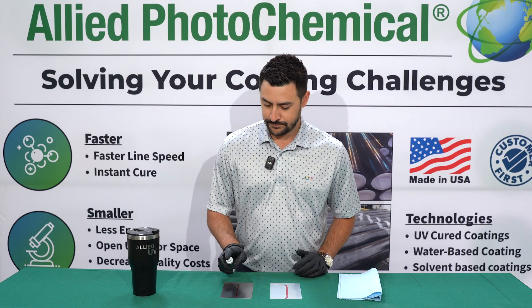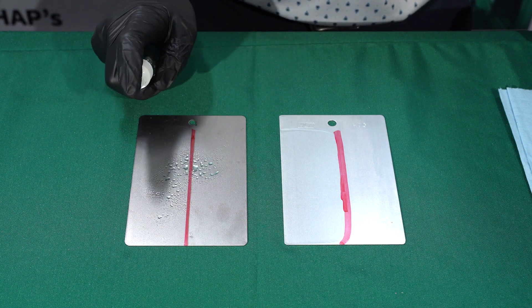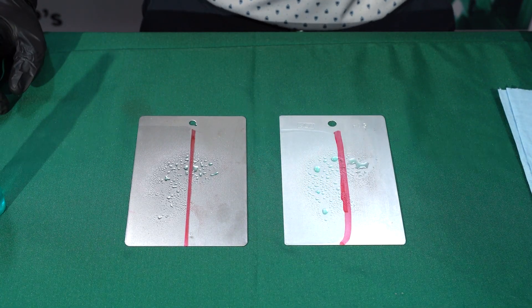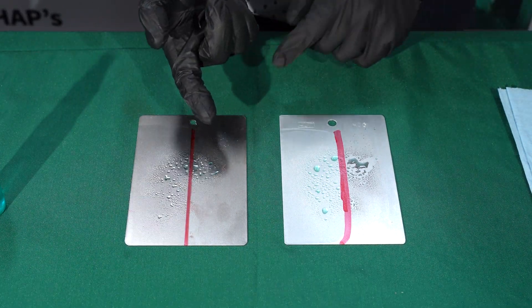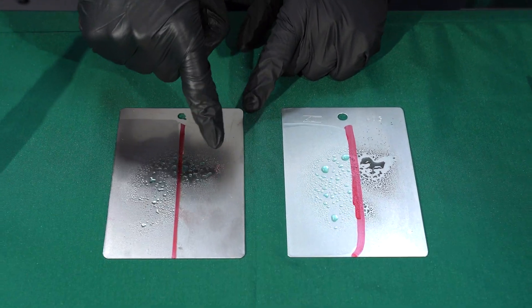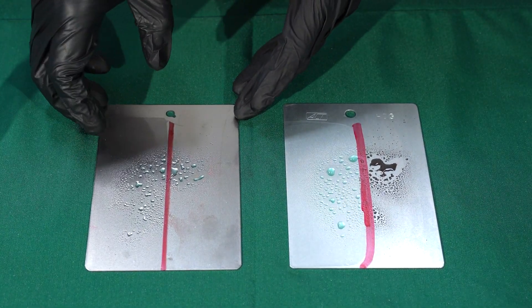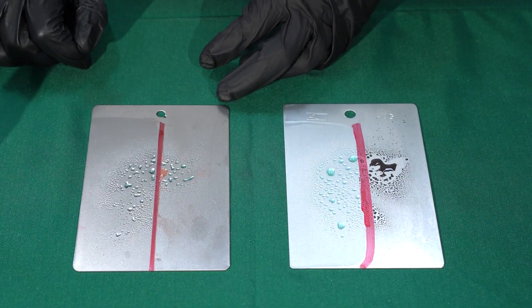See how the copper sulfate on this side is starting to turn like a reddish amber hue, and over here it's already pretty jet black. It's continuing to turn color.